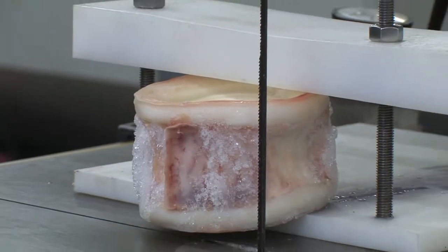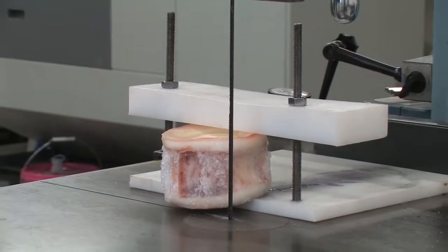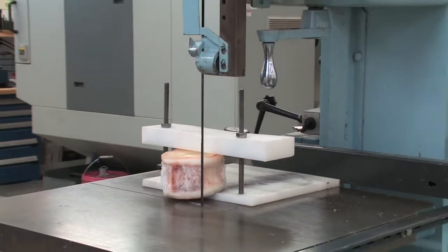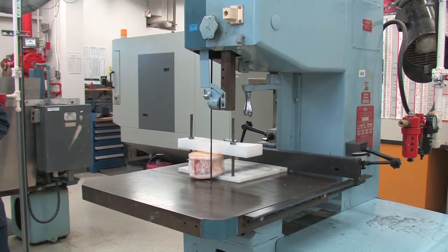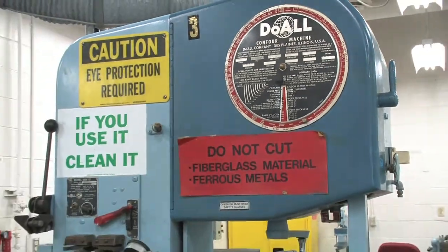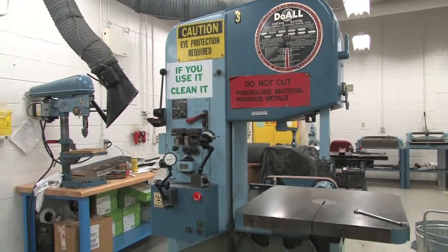Most labs are not equipped with saws capable of cutting large shark vertebrae such as whale shark and basking shark. To overcome this problem, we suggest using a large bandsaw and a custom made chuck to support the vertebrae as it is sectioned. The bandsaw shown is a Do-All Sawing Products vertical contour saw and uses a bi-metal blade with 14 teeth per inch.